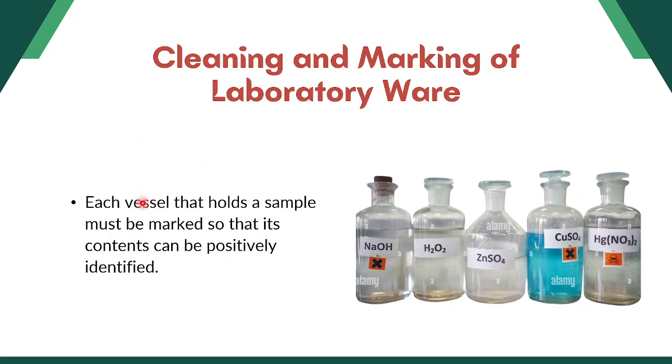And so each vessel or container, mga baso, mga beaker, mga volumetric flask, that holds a sample, they should be marked, no? Dapat na sila label, proper label, so that its contents can be positively identified. Like in this case, sa picture makita nato nga naay proper label. So ikaw na owner, dili ka maglibog unsay sulod ani nga container.